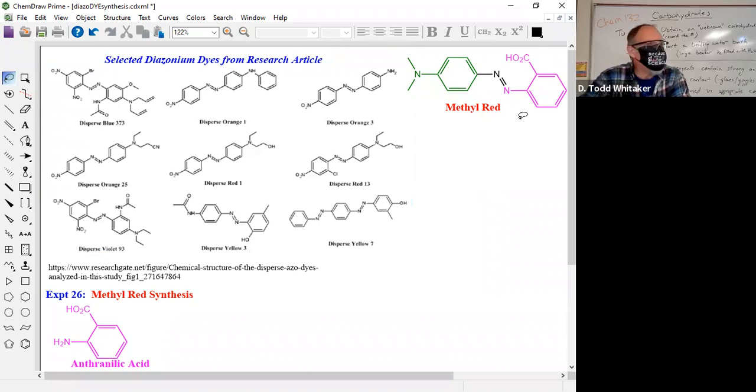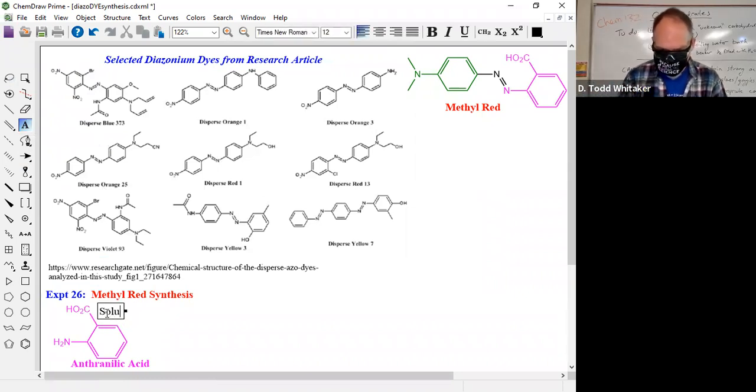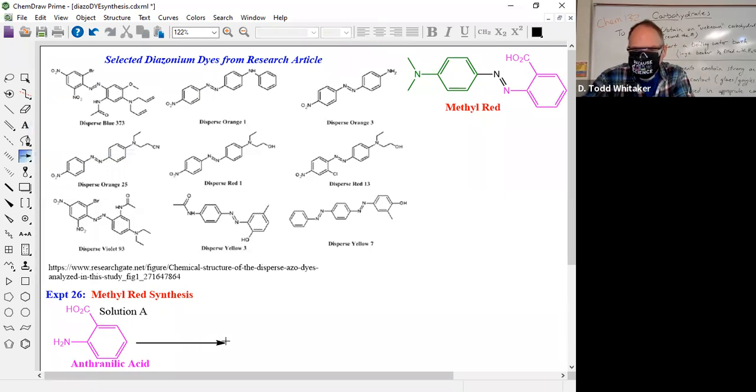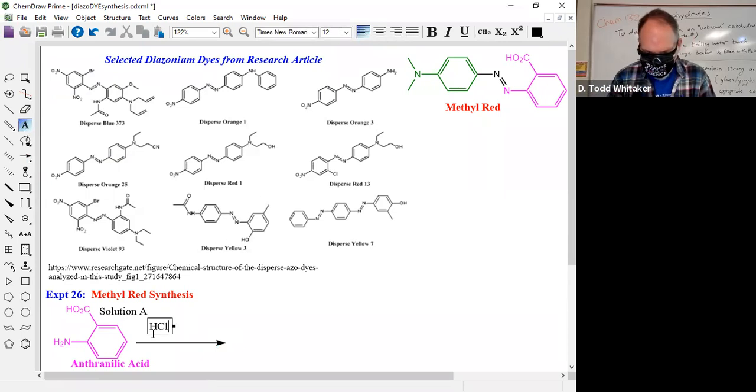We're making methyl red right now. You're doing it. Where was anthranilic acid? Which of the solutions? I need a lot of feedback today, everybody. So which solution had anthranilic acid? Solution A. What else was in solution A? HCl and NaNO2 and a lot of water, right?